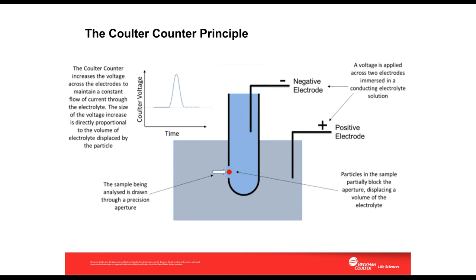The Coulter counter provides not only the equivalent spherical diameter, but also particle volume, and as such, the Coulter is very sensitive to small variations in particle radius because, of course, volume measurement represents the cube of the particle radius, i.e., volume is 4/3 pi r cubed. So any small changes in the radius are multiplied by a cube law, making them easier to detect as a volume change.